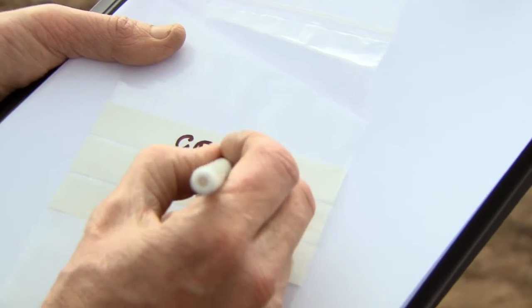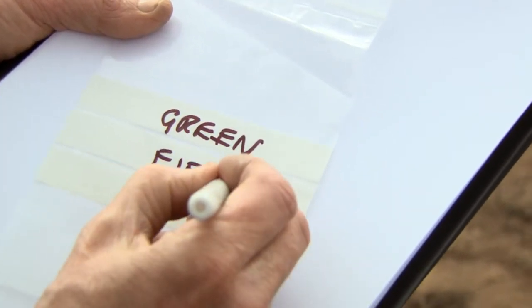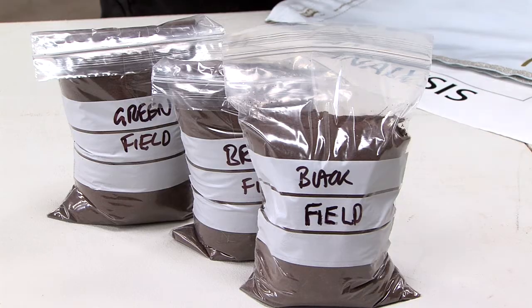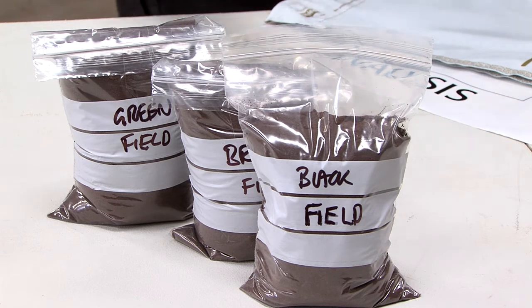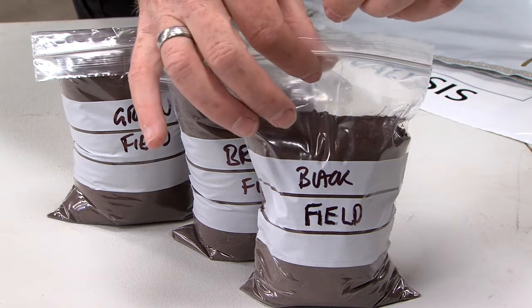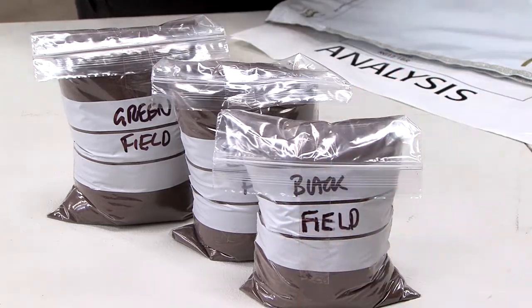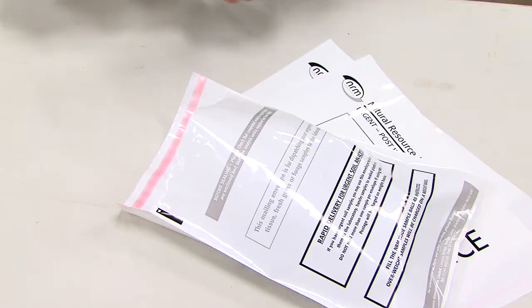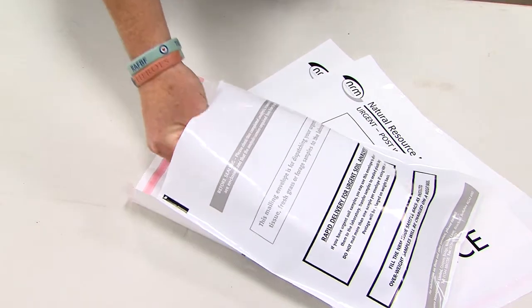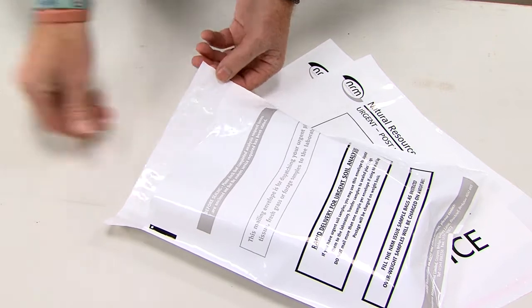Label the bag immediately with a waterproof marker pen — it is very easy to confuse soil samples when collecting more than one. A soil sample for basic pH, phosphorus, potassium, and magnesium is stable and should be delivered within a week to the laboratory. Collecting a sample carefully takes time, so avoid trouble with delivery and processing by using clear labelling, secure packing, and the correctly completed paperwork for the laboratory.